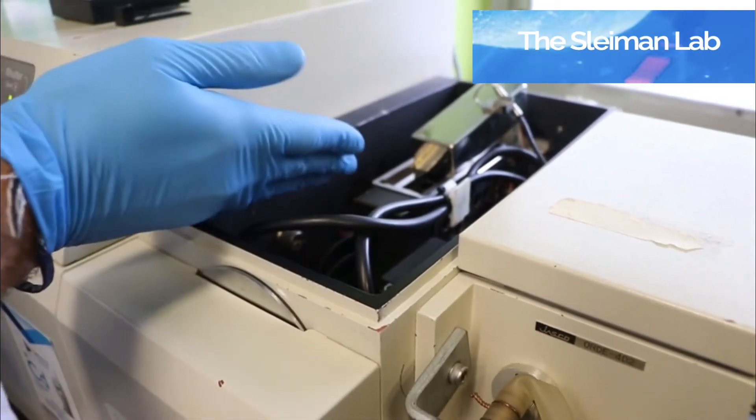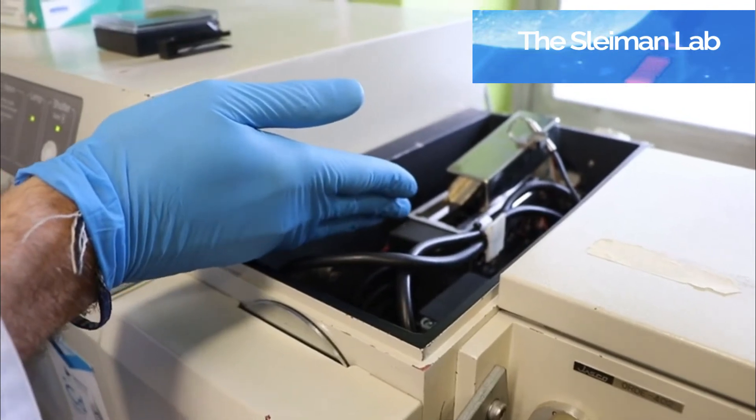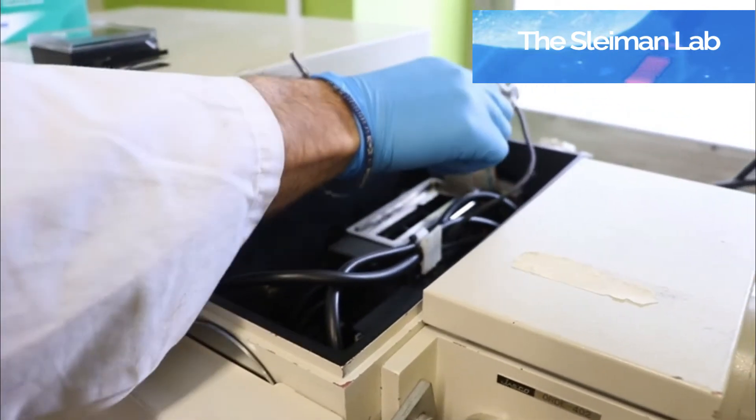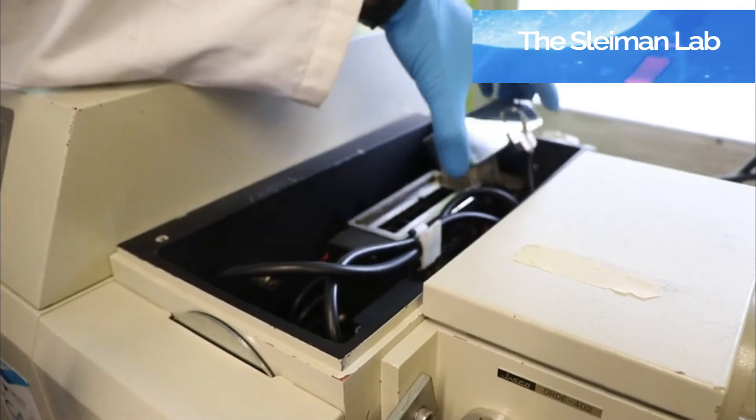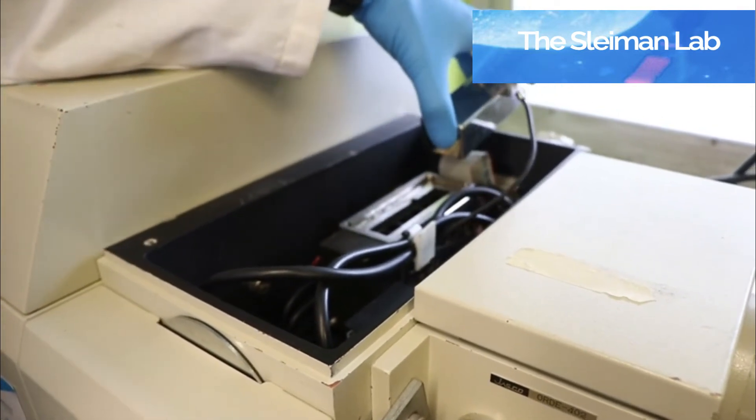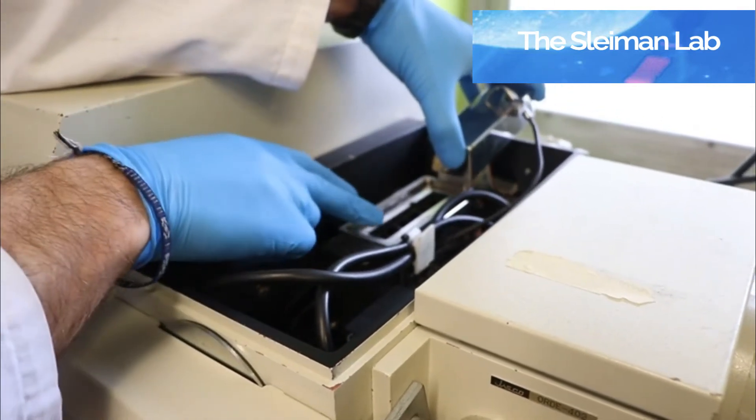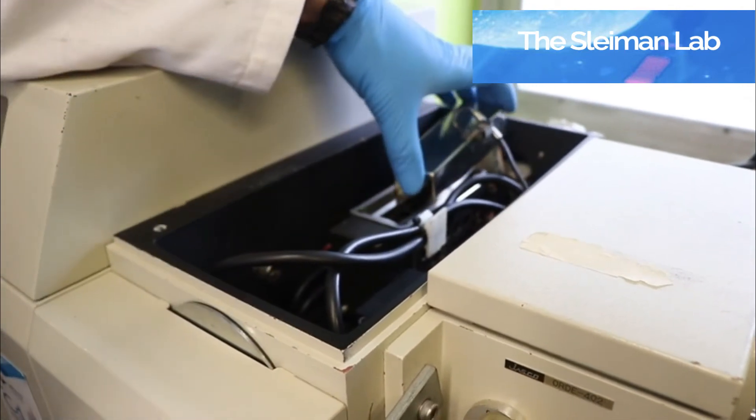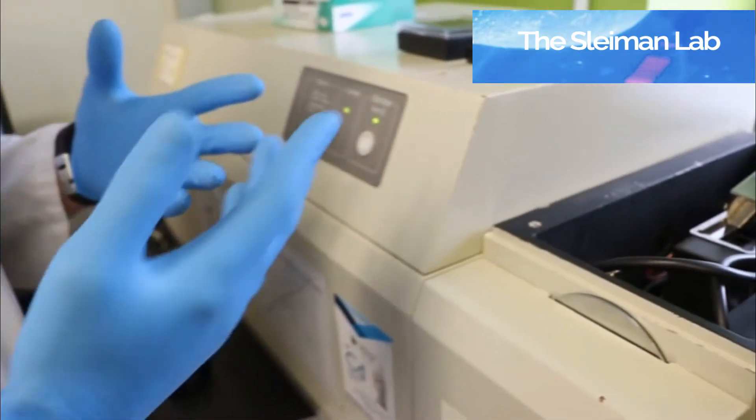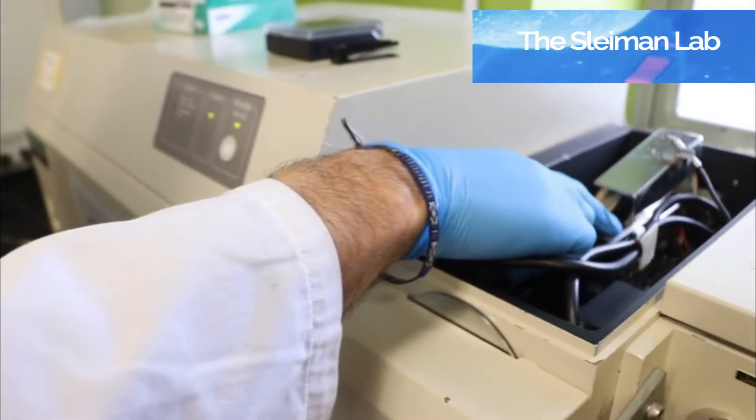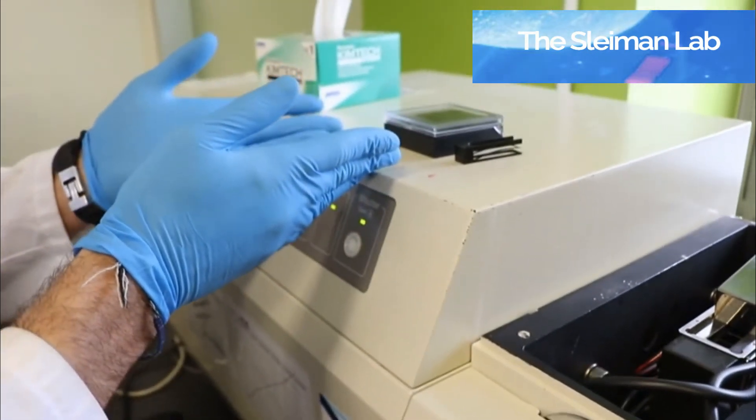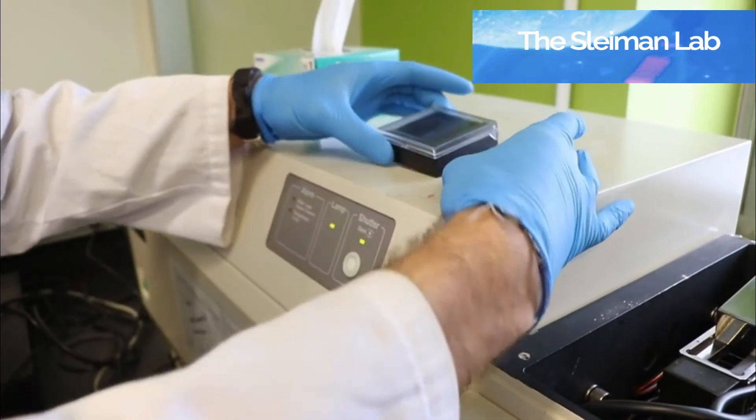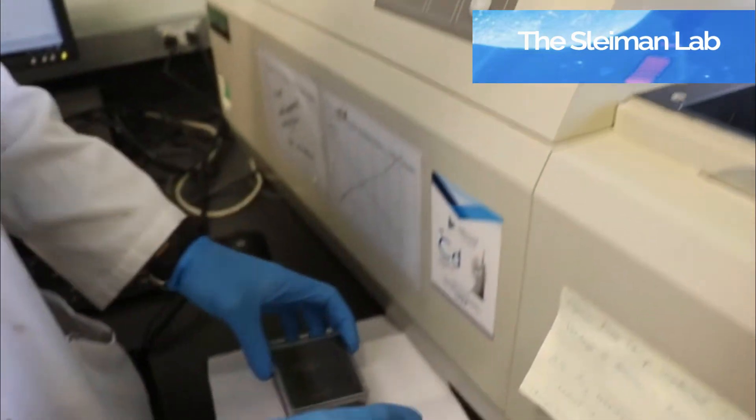So this is the sample holder inside of the instrument. You can see this particular model has six different positions. We will be using the first one. You can put a variety of cuvettes in there, from the 1 cm ones to the 1 mm ones, to in our case, the 0.1 mm one, which we'll be loading here.